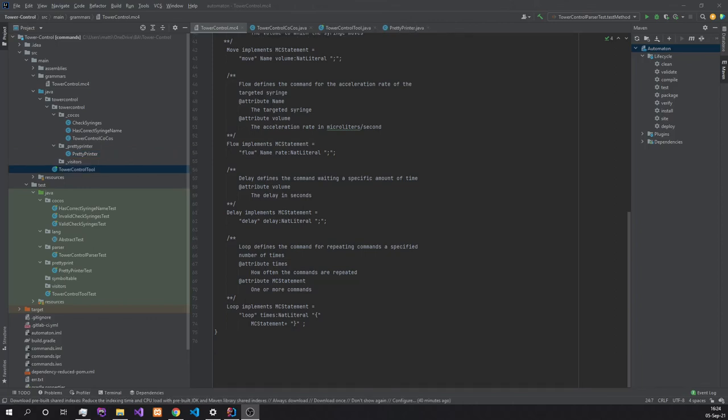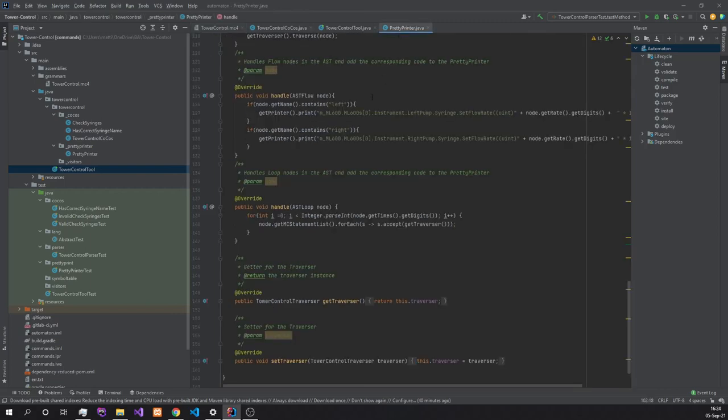If the user now wants to add more to the grammar, they simply add it down below here. Afterwards, they should validate and compile it, of course, and then go over to the pretty printer where they're overriding the created handle method for the corresponding, now created, new node in the abstract syntax tree. Here, it is also important to note that if the developer has created a new production for a syringe operation, they need to check whether the syringe is either left or right, because depending on this, they need to target either the left pump or the right pump.